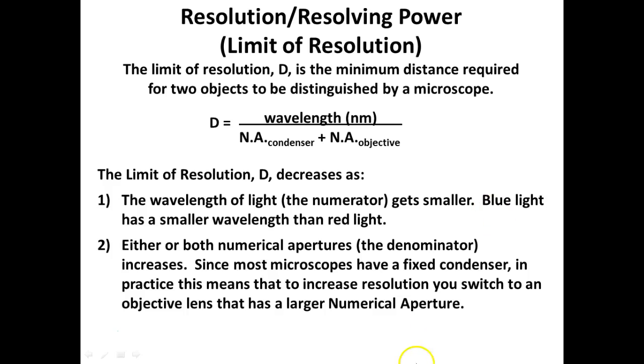Remember, for your microscopes themselves, the numerical aperture for each of those lenses is fixed. It cannot be changed. It is a glass lens, it's stuck where it is. You can't change it like we can the lens in our eyes. Can't change the shape. So, of course, as we increase in magnification, so does the resolution. Otherwise, we wouldn't be able to see.